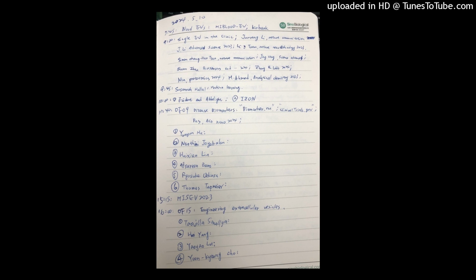This is the result of whole genome sequencing. CNV status of EV DNA in ascites reflected the status of tumor DNA. However, the status of EV DNA in serum didn't reflect that of tumor DNA, probably because the concentration of DNA derived from the tumor was very low.